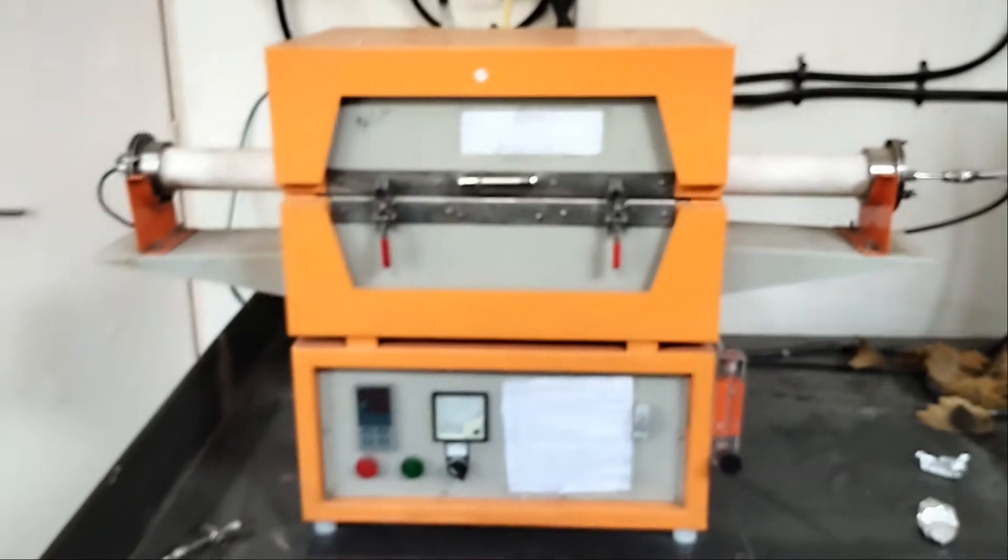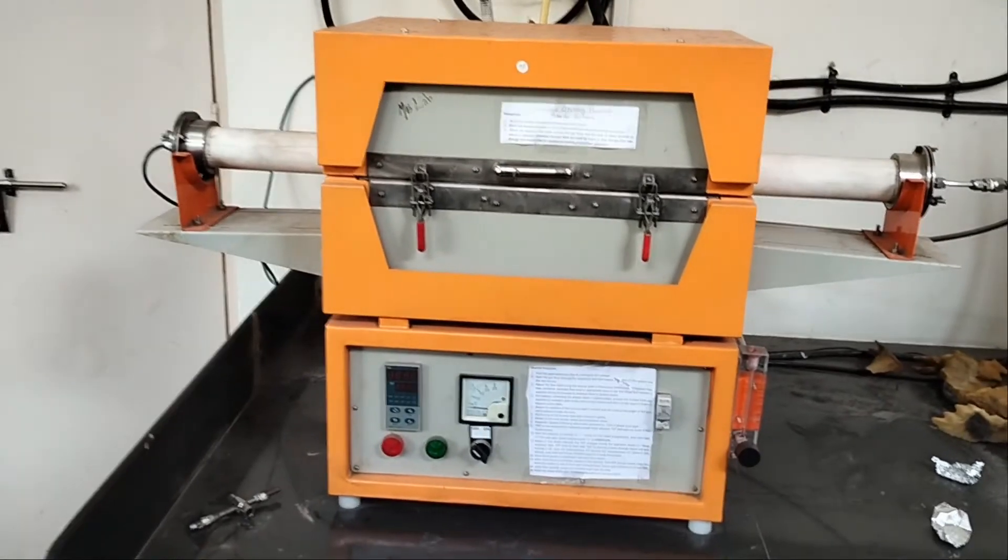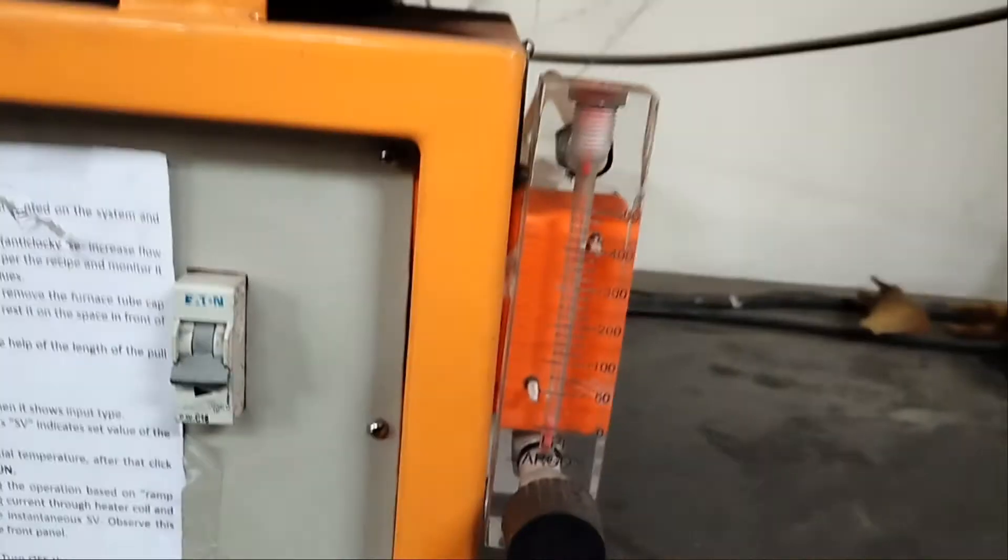So this is how the tube furnace looks after insertion. This is the flow meter for the inert gas, and the backside will be the flow meter for the hydrogen gas.